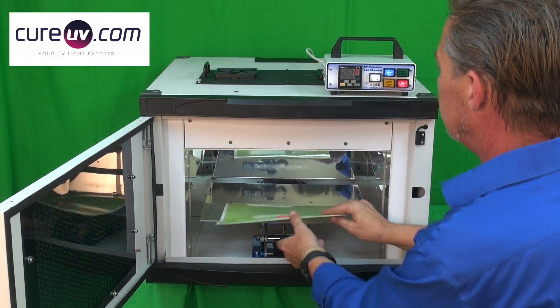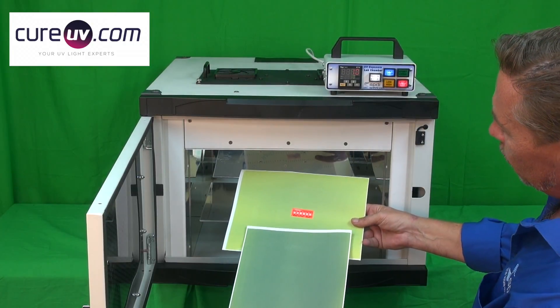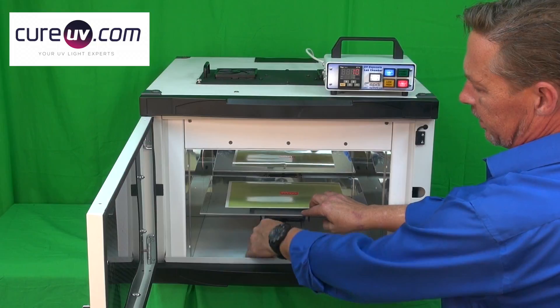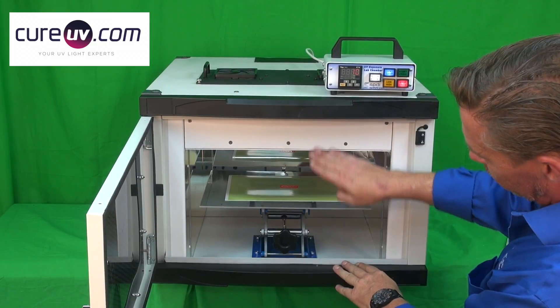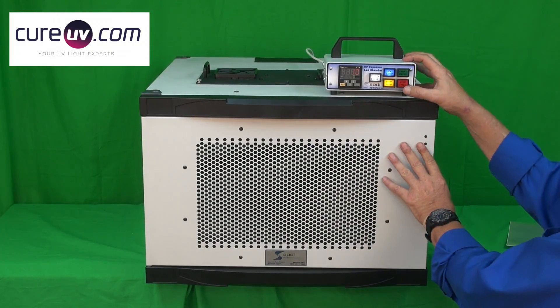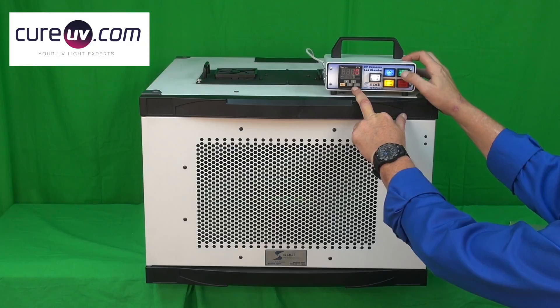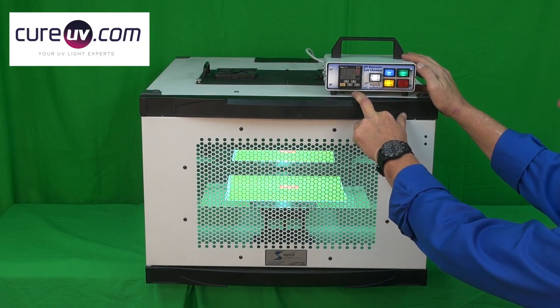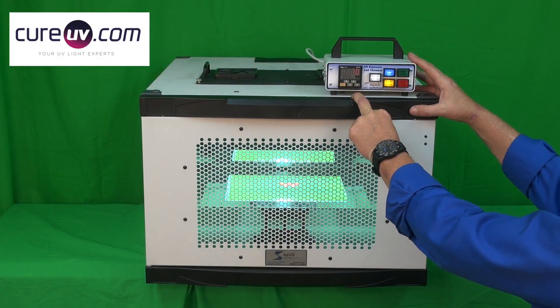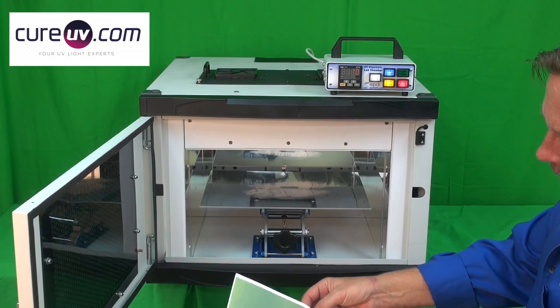As you can see the level of UV emission — all we have to do is increase that emission, either bring the specimen closer to the source, increase the intensity output, or readjust the time to extend the exposure time — but all rapid, simple, and repeatable so that anybody can use and create qualified, quantified scientific data and deliver it in a nice controlled fashion.